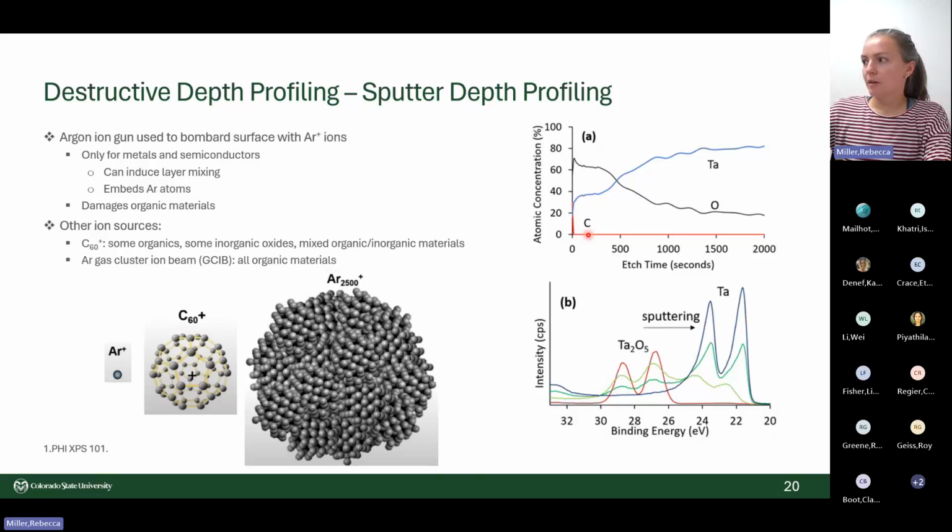If you want this with sputter depth, that relies on having a standard for your sputter rate. So different materials sputter at different rates. Maybe there's a rule of thumb, this much per minute is sputtered, but because it can change based on the material, it's best to have your material in a known thickness and sputter that and get a calibration constant for the sputter rate.